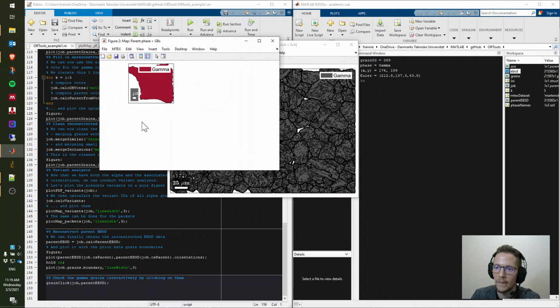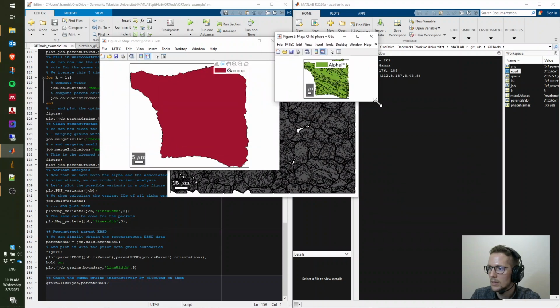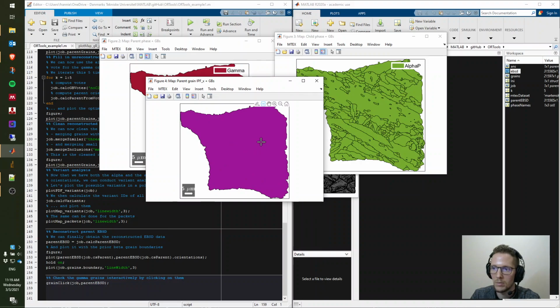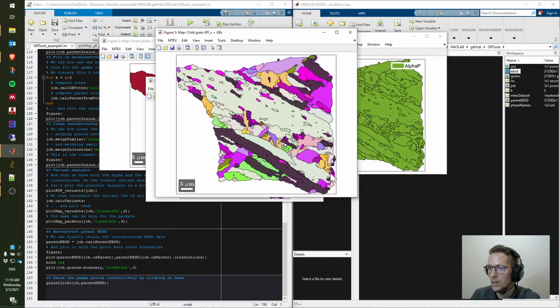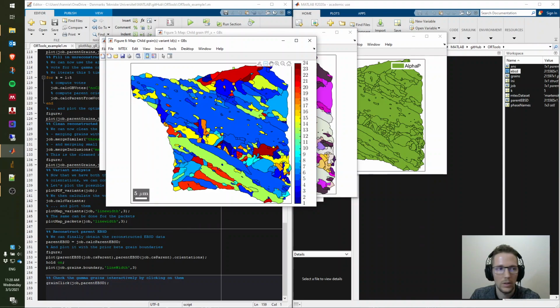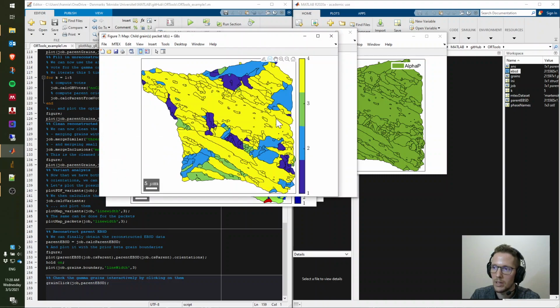This is the parent orientation of the grain. Sorry, it's not the orientation. This is the parent phase. This is the child phase map. Then we have the parent grain inverse pole figure in x direction, and you can of course change this. Then we have the child orientations as an IPF-X, so inverse pole figure. Then we have all the variants of that child grain. So here color code 1 to 24. Then we have a packet map where it shows us all the packets within this grain.